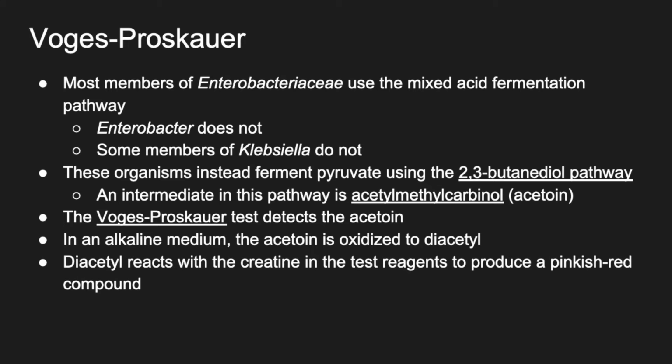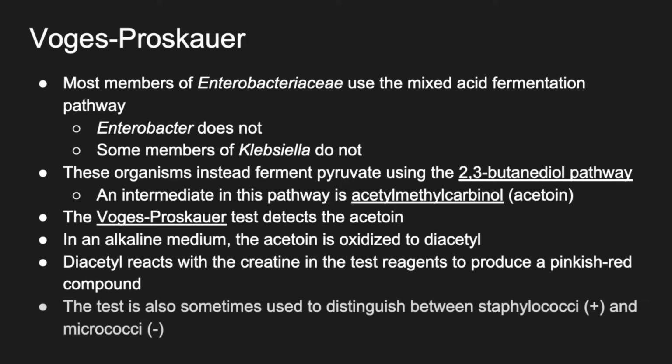So this is all taking place in a basic medium. Alkaline means basic, right? The acetoin is being oxidized to diacetyl. The diacetyl reacts with creatine, that's in the test reagents, and it produces a pinkish red compound. This test is also sometimes used to distinguish between staphylococci and micrococci.